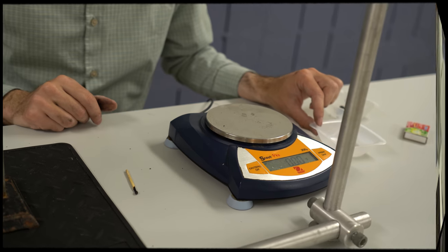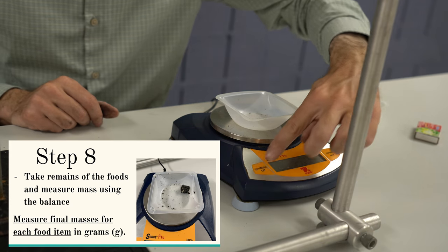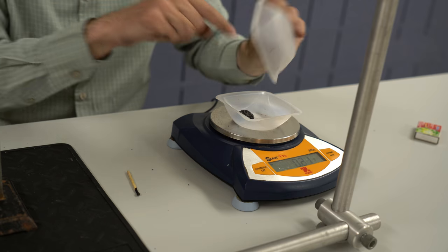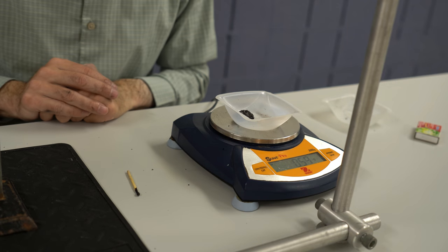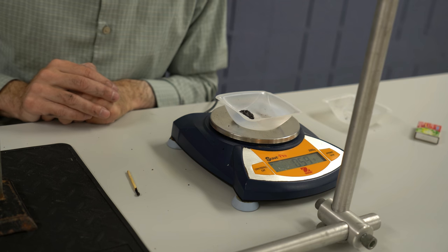So we got to get the mass of that food item. So I put an empty weigh boat here. We're going to zero that out. Take our burnt food item, put that in there. And now we're going to have a mass of only 0.60 grams.